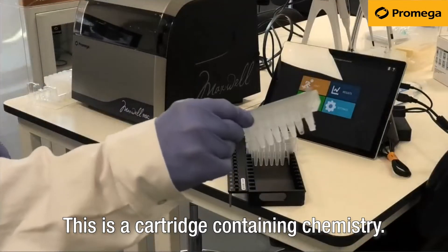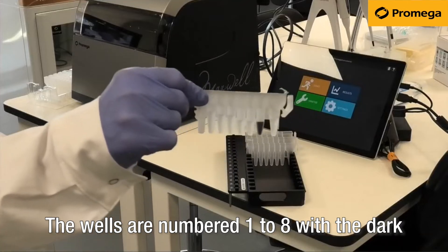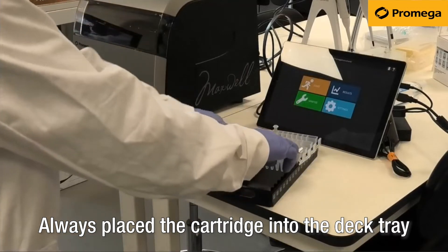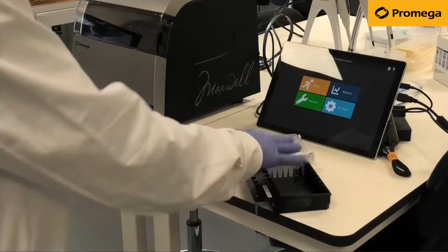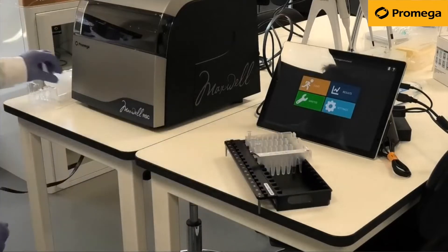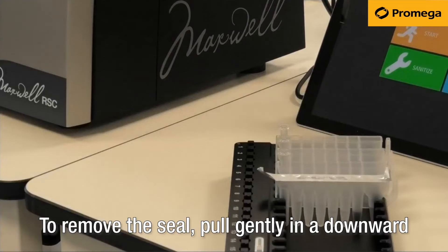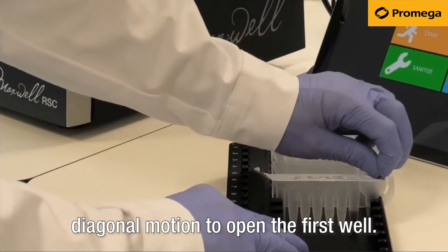This is a cartridge containing chemistry. The wells are numbered 1 to 8 with the dark coloured resin in well number 2. Always place the cartridge into the deck tray before removing the seal. To remove the seal, pull gently in a downward diagonal motion to open the first well.